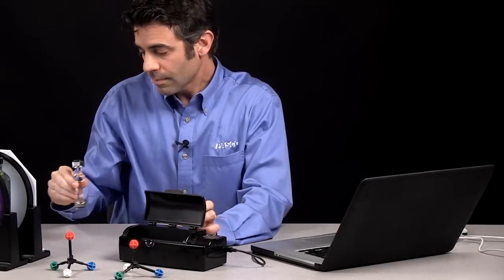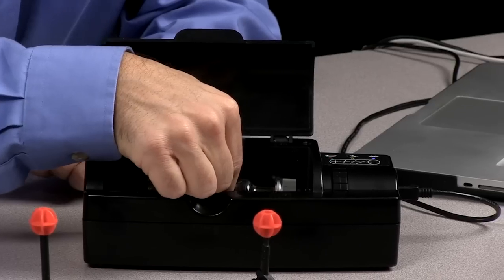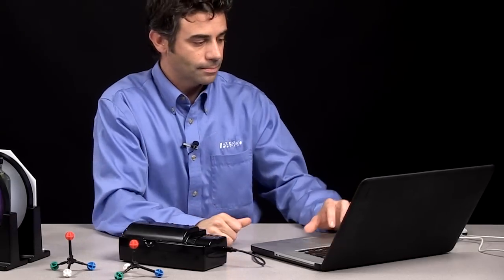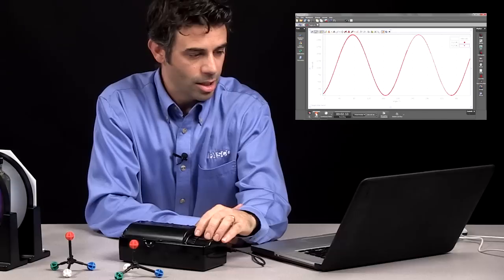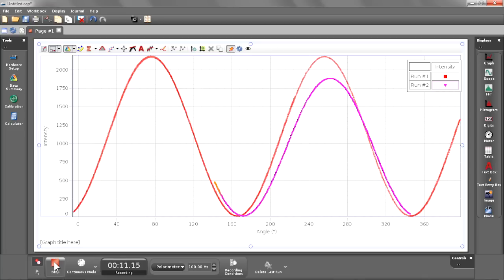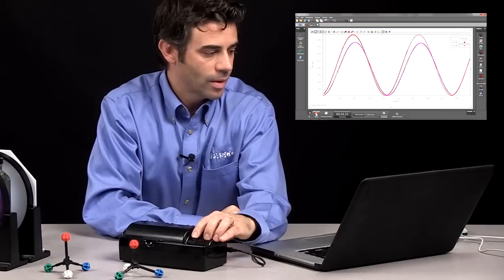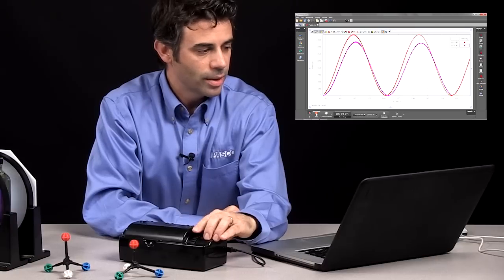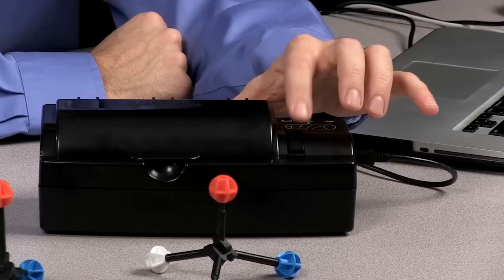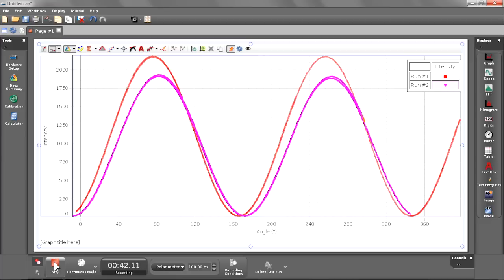Now I'm going to take this sample out. If you're doing this as an actual experiment, you probably want to use the same sample holder each time, but for this purpose I'm going to use a different sample holder. I'm putting in a sucrose solution. I'm going to start recording again and spin the wheel. Notice the intensity is a little different — that makes sense, there's something in there. Also notice that the peak intensity is shifted slightly from where it was before, because there is an optically active chiral compound in there that shifts the plane polarized light. The wheel has a notch so you know where you start and end, and you can also look at the graph to confirm you're going from 0 to 360.